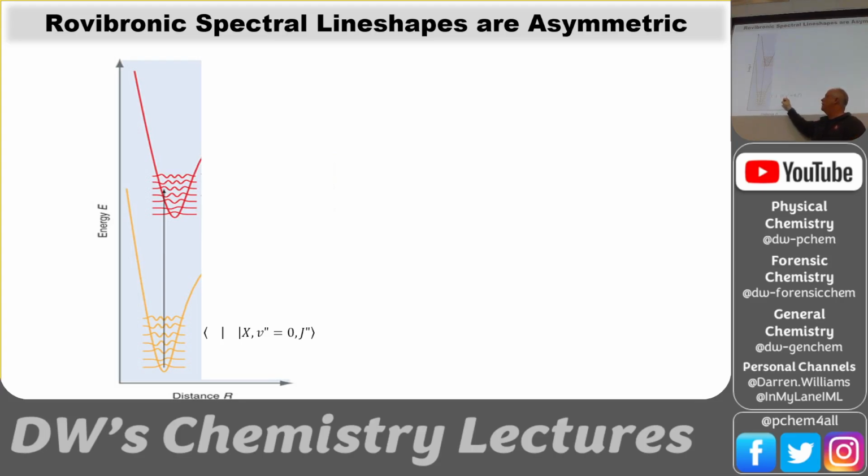Okay. And then we have the vibrational level. V double prime equals 0 for this one here. But we're also in the iodine lab going to have V double prime equals 1 and 2. So we're going to have 3 lower vibrational states. So we have down here 0, 1, and 2. And then the J values, we're going to have a whole bunch of J values, and you'll see that on this chart.